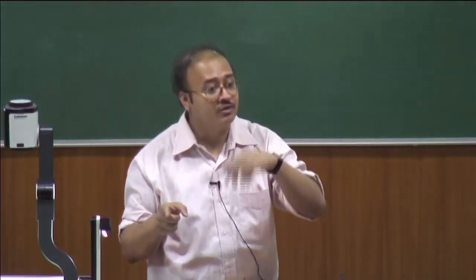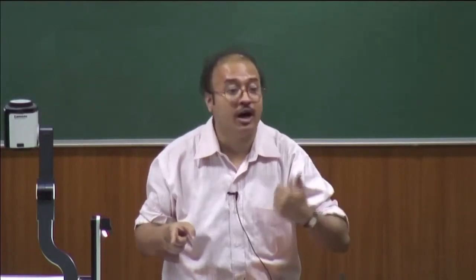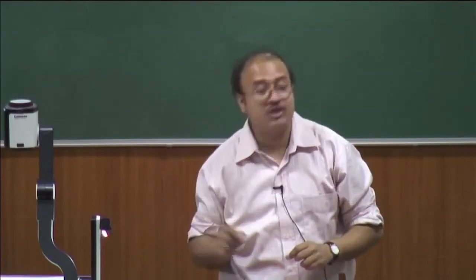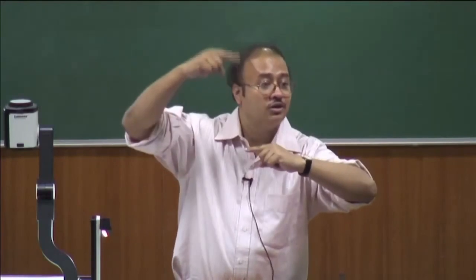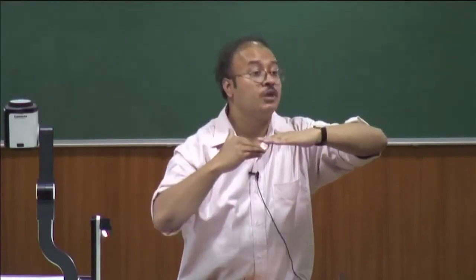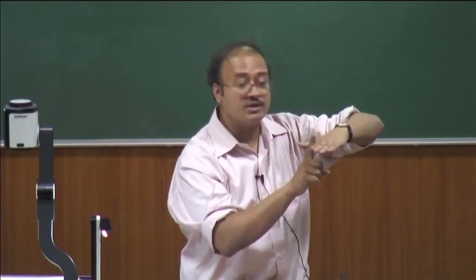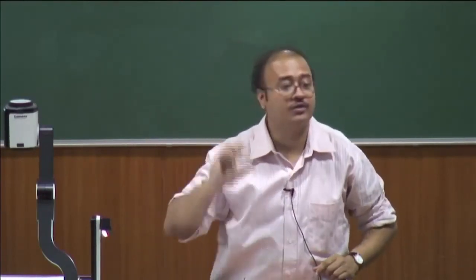So, whatever decrease or increase you would be having would not be related to the sample, but would actually be an artifact of what? The light that you sent through. So, then what you do is, this reference photomultiplier, you know what it does? It always normalizes with respect to your beam that is coming in. So, you take your actual sample and you divide it by the reference photomultiplier intensity. That means that one actually normalizes whatever intensity you have, and you get the corrected fluorescence spectrum.